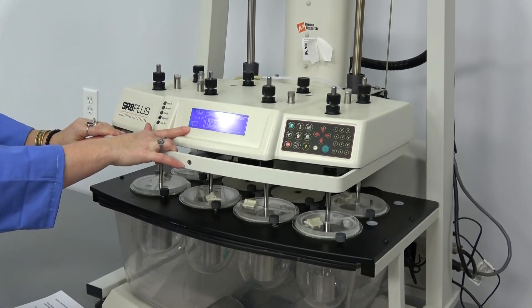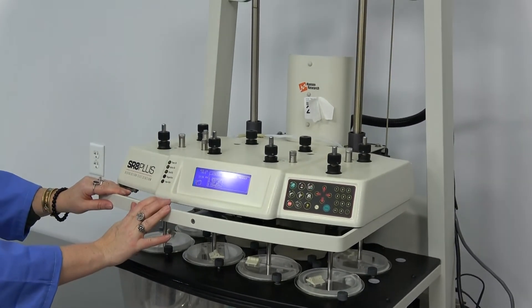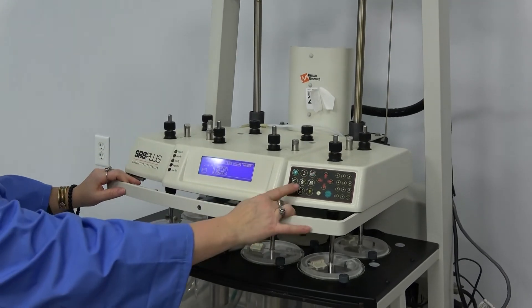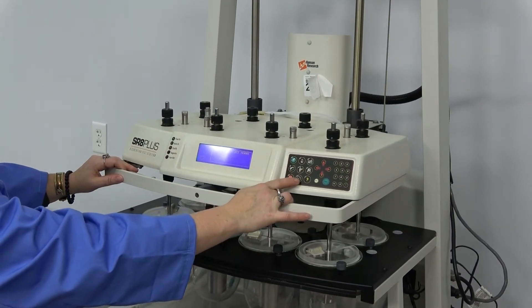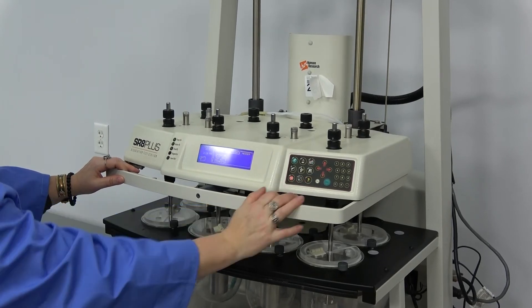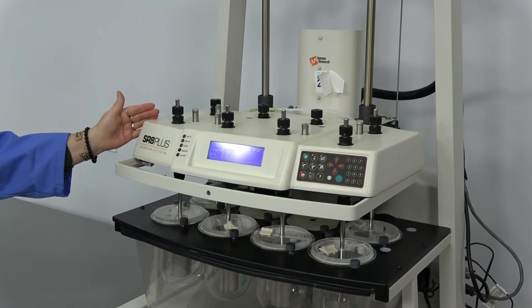This can be programmed to hold up to 25 test protocols. It shuts off easily or you can time it to shut off. And that is the SR8 Plus.